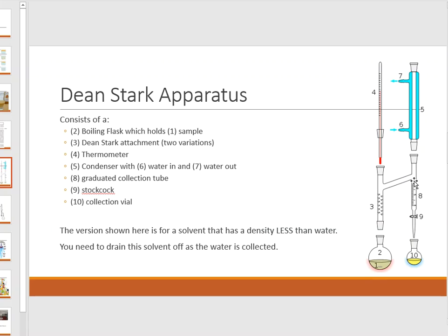So this almost looks like a burette now instead of a graduated cylinder, right? It looks like a burette more than it does anything. Well, there's an issue here. There's something that's going on here that we need to talk about and that we need to focus on. And I'll talk about that in just a second. But if the vapor continues to go up, what you'll see is that it will go up into the condenser.